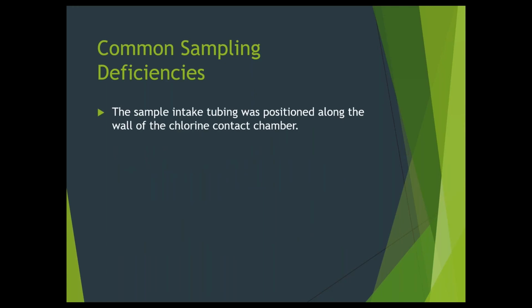So sample tubing was positioned along the wall. Again, there's no rule or hard and fast law that says you can't do that. But if you do it, you might end up with excess solids.